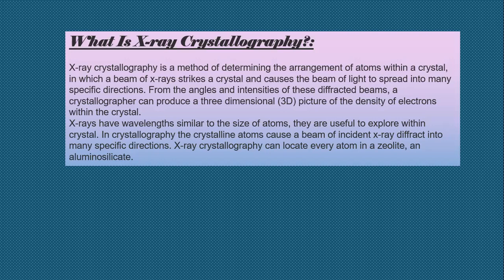X-ray crystallography has been fundamental in the development of many scientific fields. In its first decades of use, this method determined the size of atoms, the lengths and types of chemical bonds, and the atomic scale differences among various materials, especially minerals and alloys.